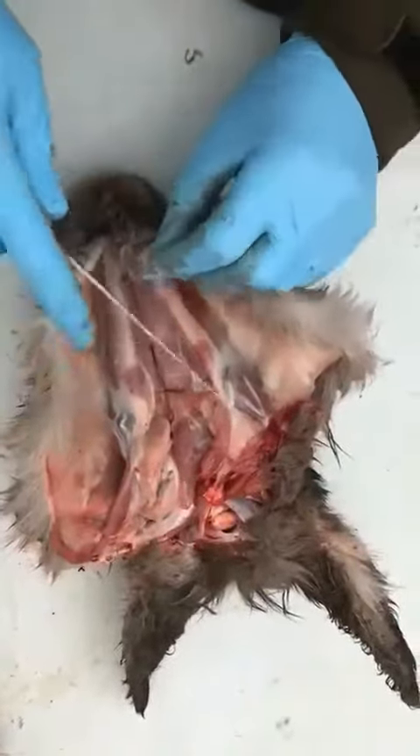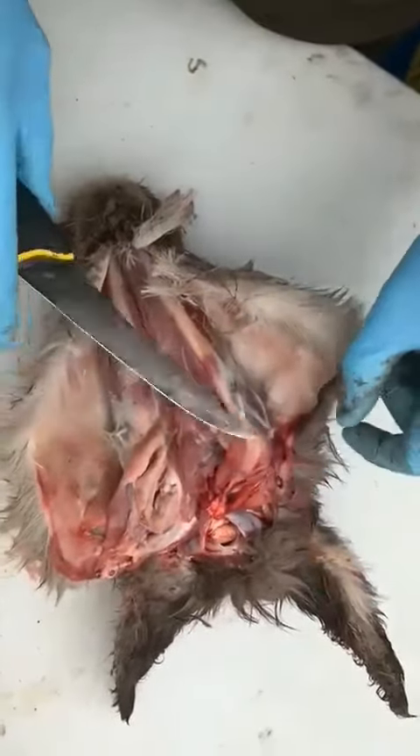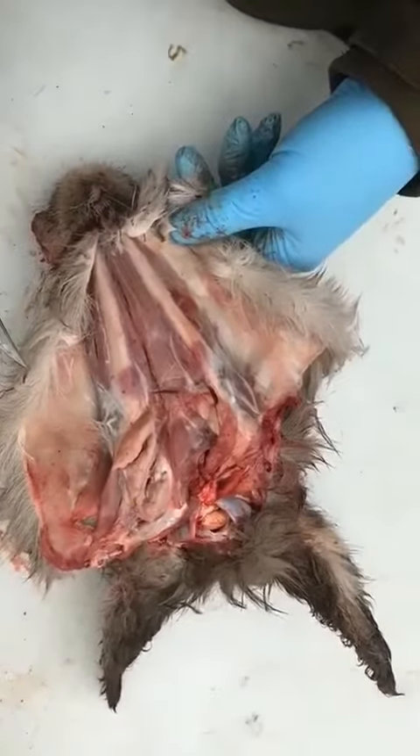Once you peel back the skin on the jaw, you can check it. There we have them here and here — the lymph glands. I hope that was useful. Thank you.